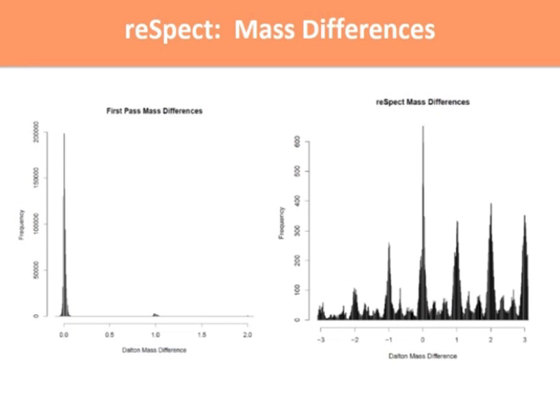So here we show you the mass differences of the results after running Respect a couple of times. You see that on the first pass search, the first time you do the search, you typically use a very narrow mass window. We talked about this on the search day, and when we do the tutorials the next couple of days, we'll see how to set up the parameters for a standard narrow mass window. You'll see that the search tools allow you to not only specify a narrow mass window, but also they can automatically look for the same narrow mass window at isotopic offsets. And you'll see why this is actually very powerful.